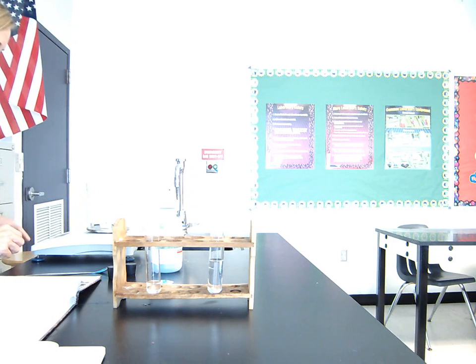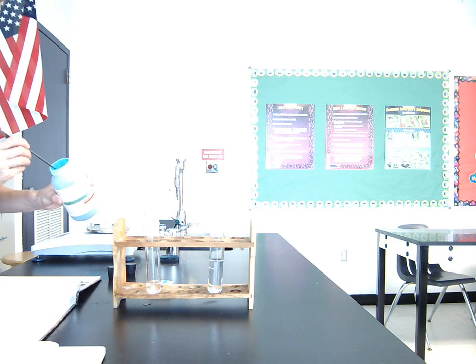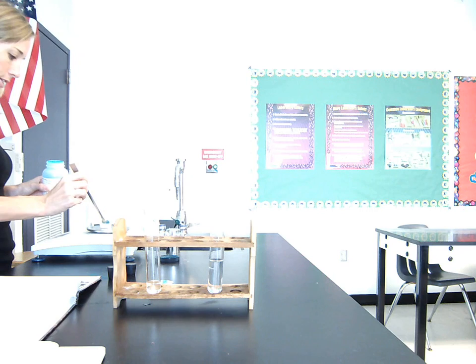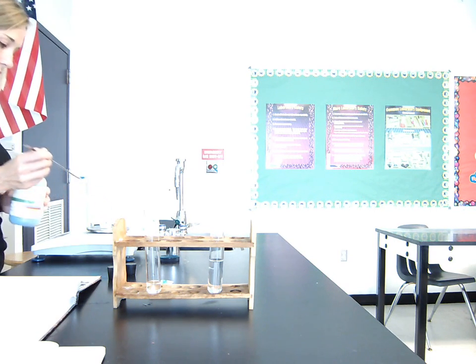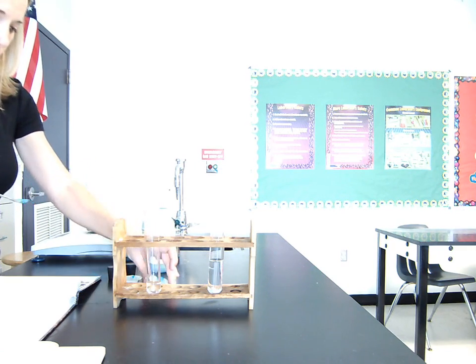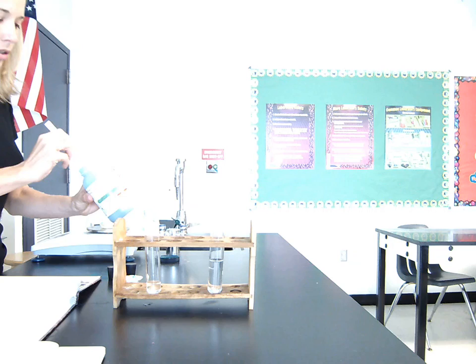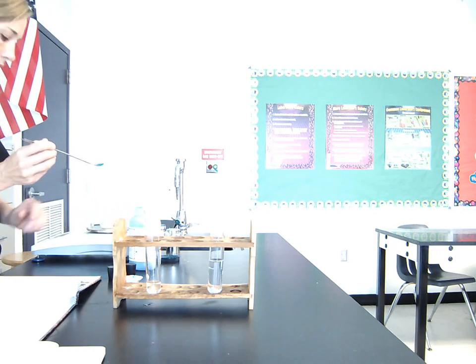So if you read through the lab, the first thing that they want us to do is to add 0.15 grams of the blue stuff to each of the test tubes. So we're going to measure out 0.15 grams, and we're going to add it to each of the test tubes, and then we're going to shake it up and kind of see what happens. See if it dissolves, that sort of thing. And if you look ahead to some of the blue dot questions, you'll get an idea of what we're going to be looking for.